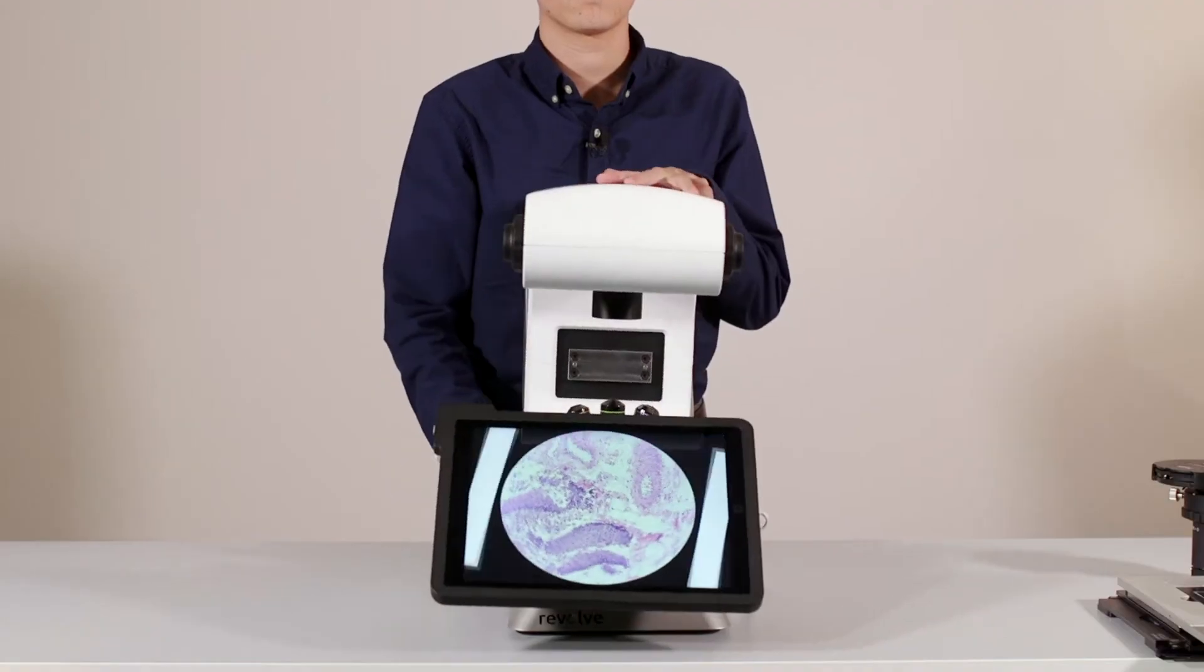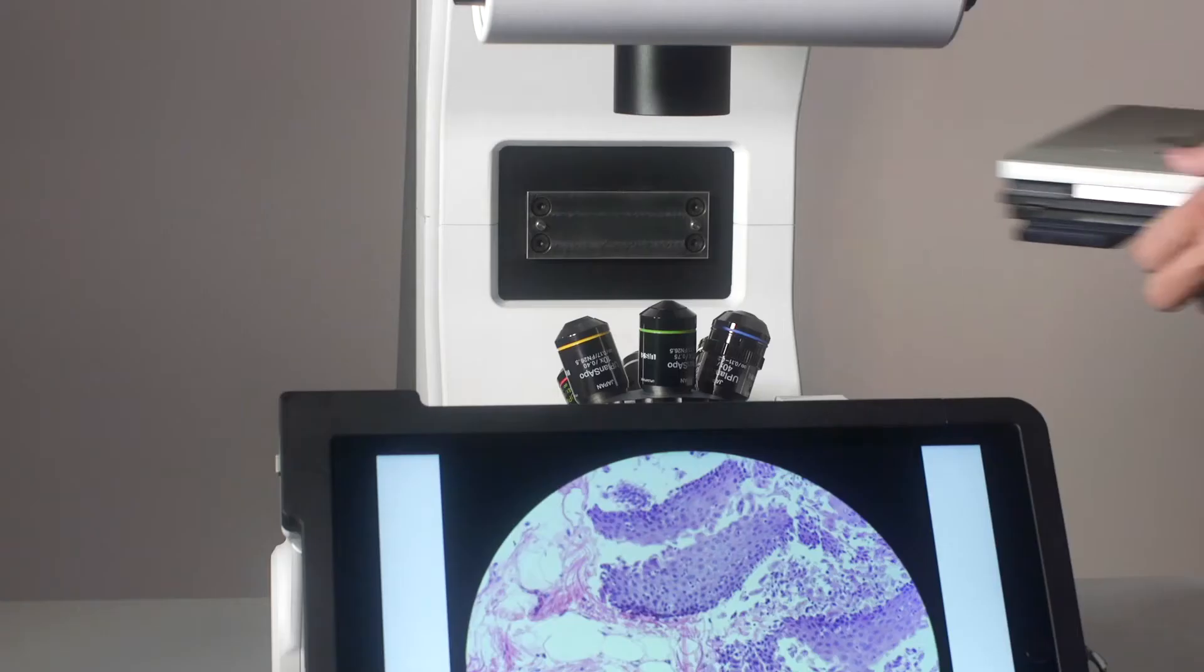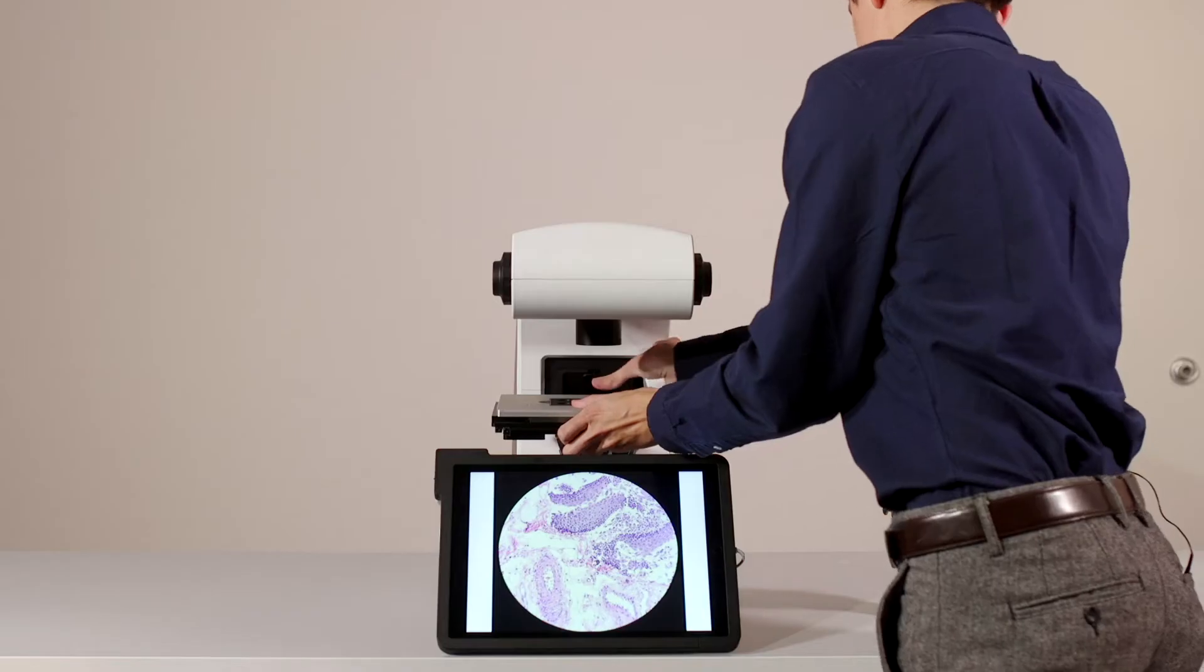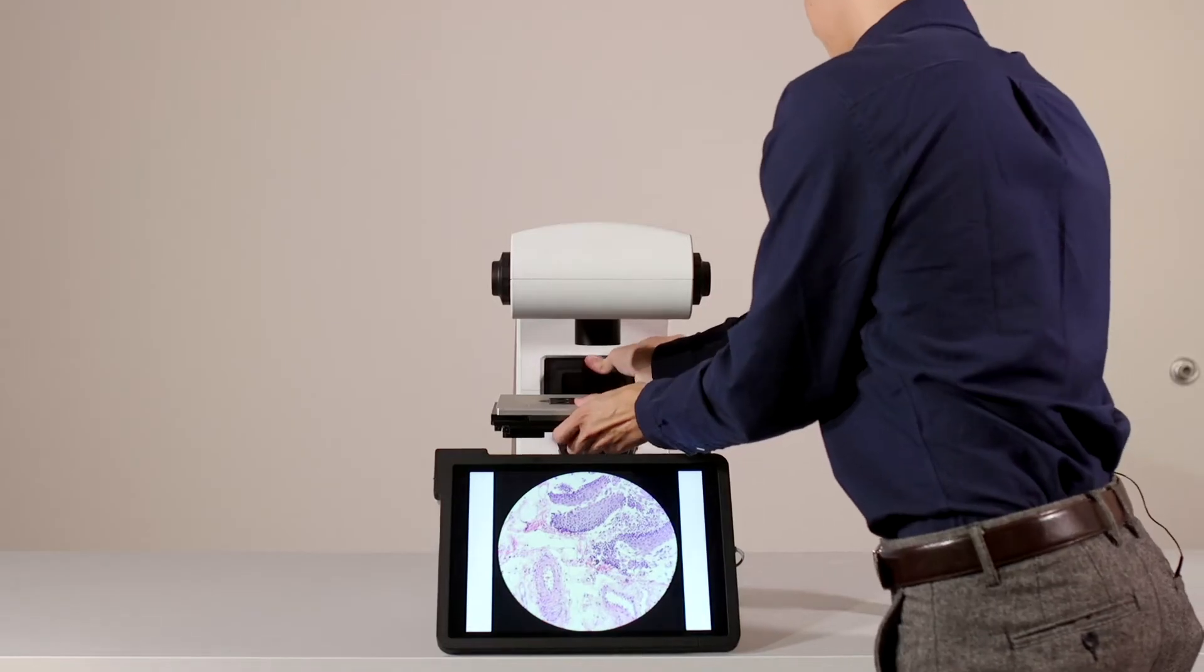To finish up, I'll reinsert the stage, close the latch, and now we're ready to begin inverted imaging.